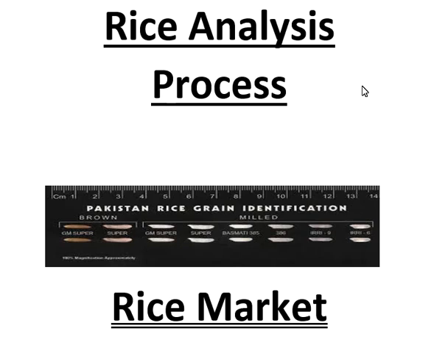The goal is so that a newcomer would be able to make the processing report by himself and also understand the quality of rice — he can judge how much broken it has, how much other variety it has. If his sample has more broken, he can argue to his seller to reduce the price. If it has more other variety and his client is conscious about that, he can change his decision about purchasing that sample.